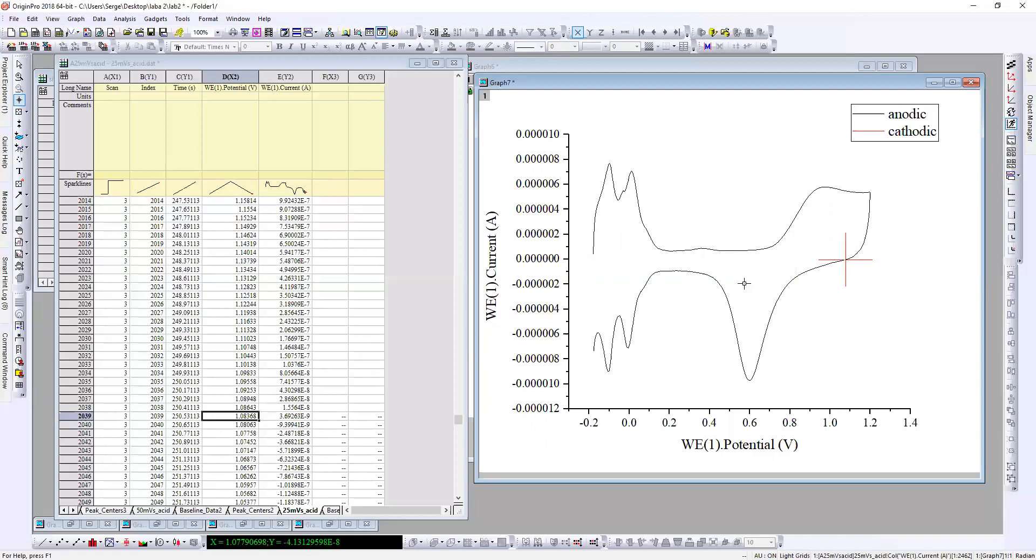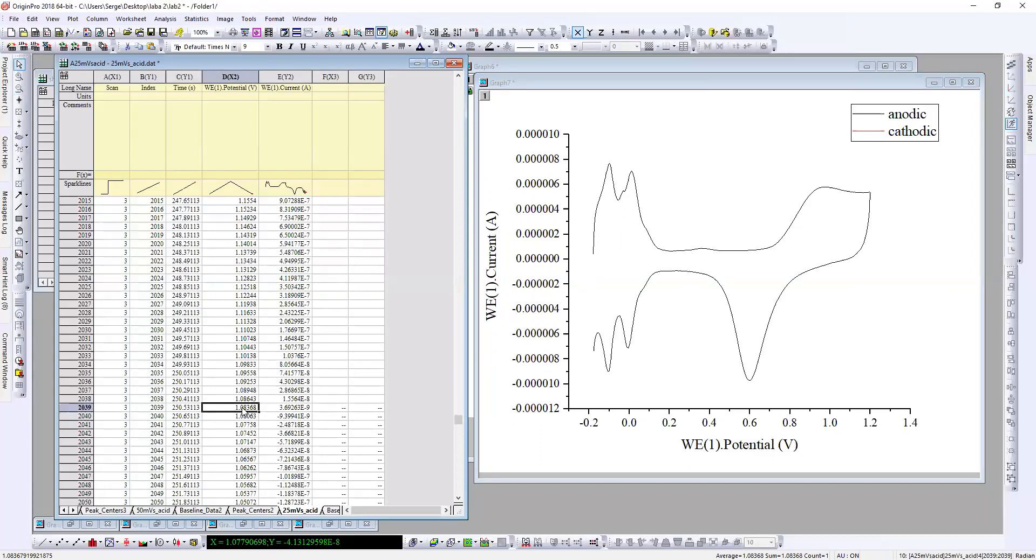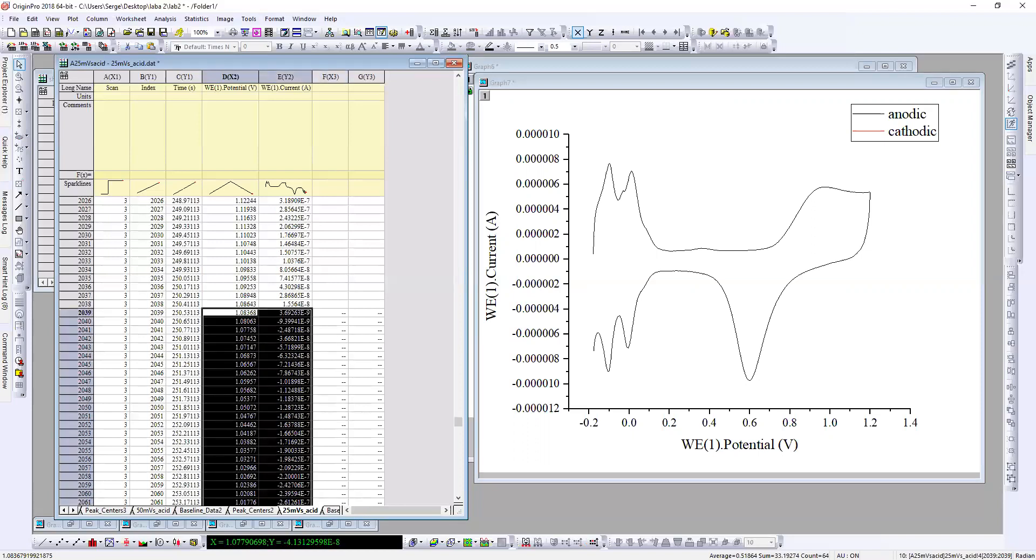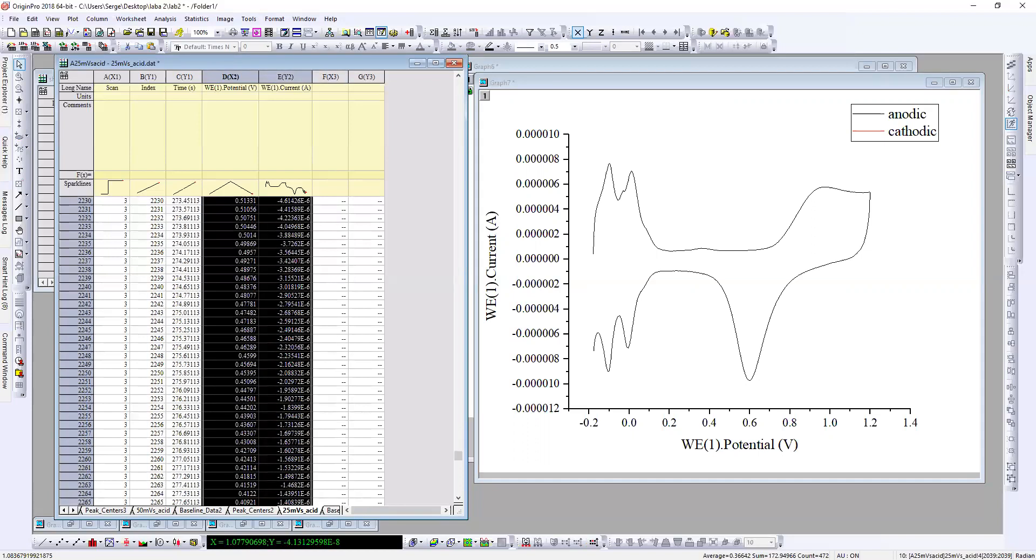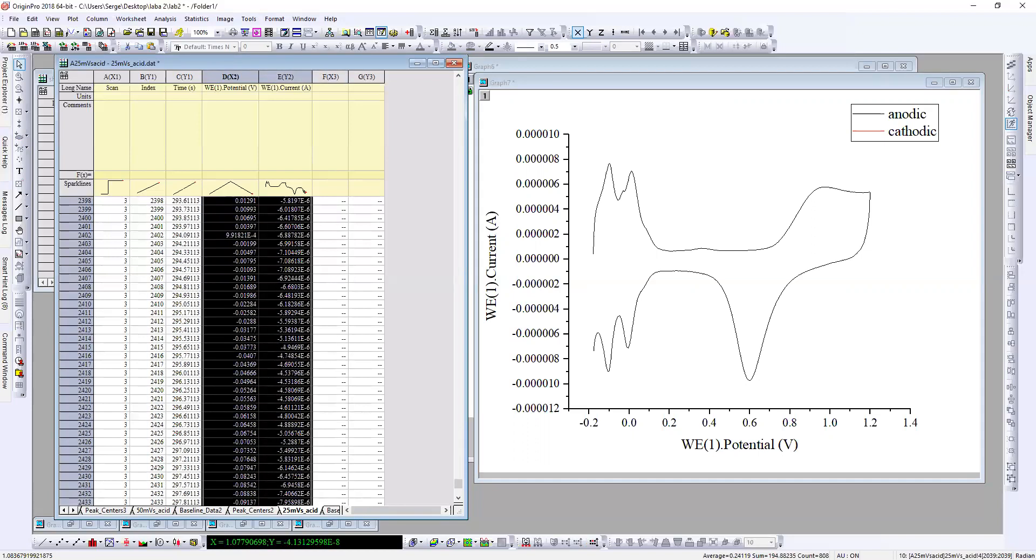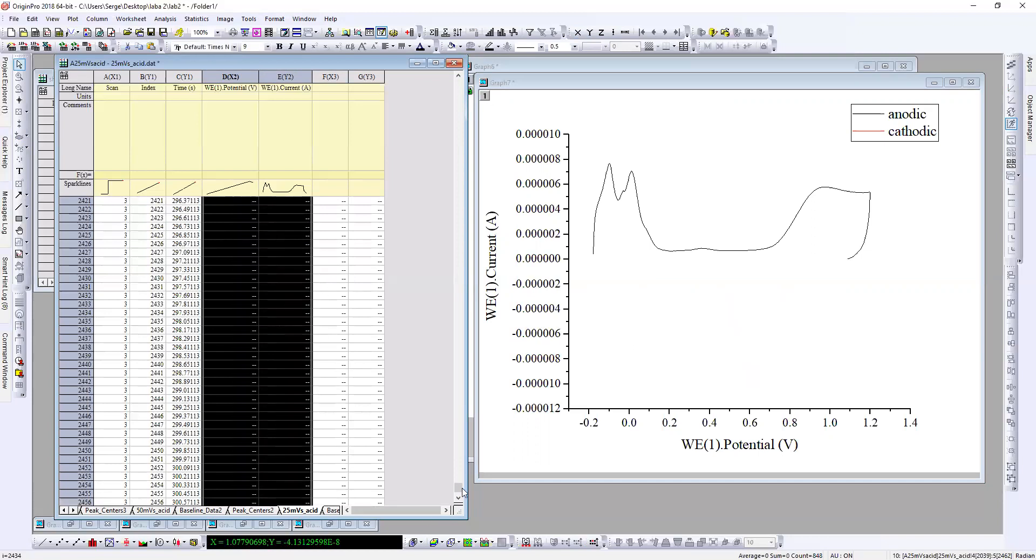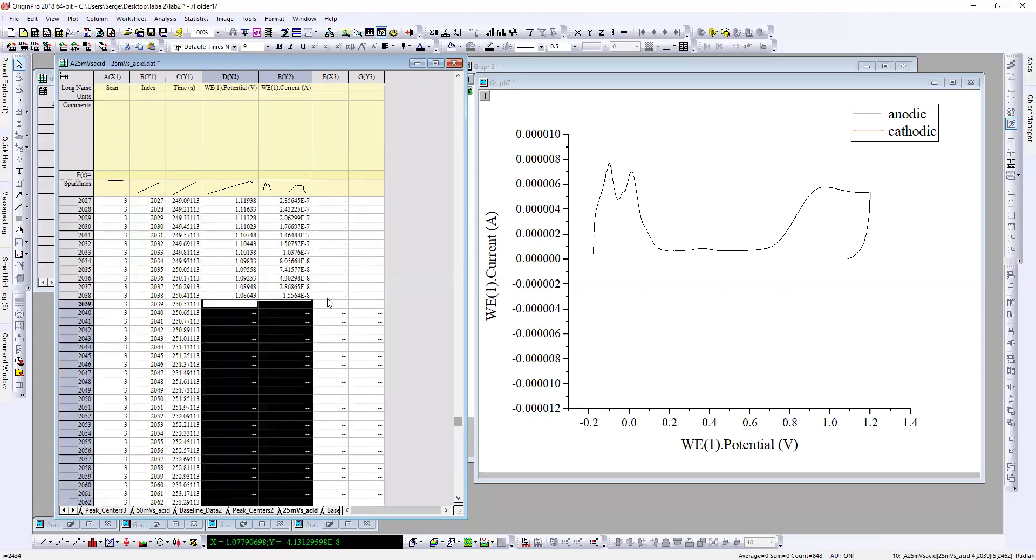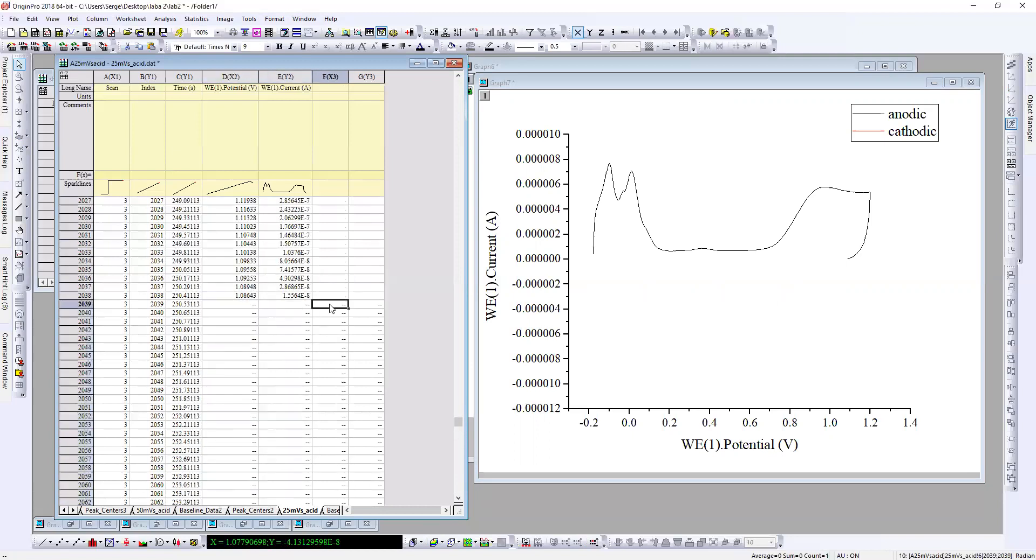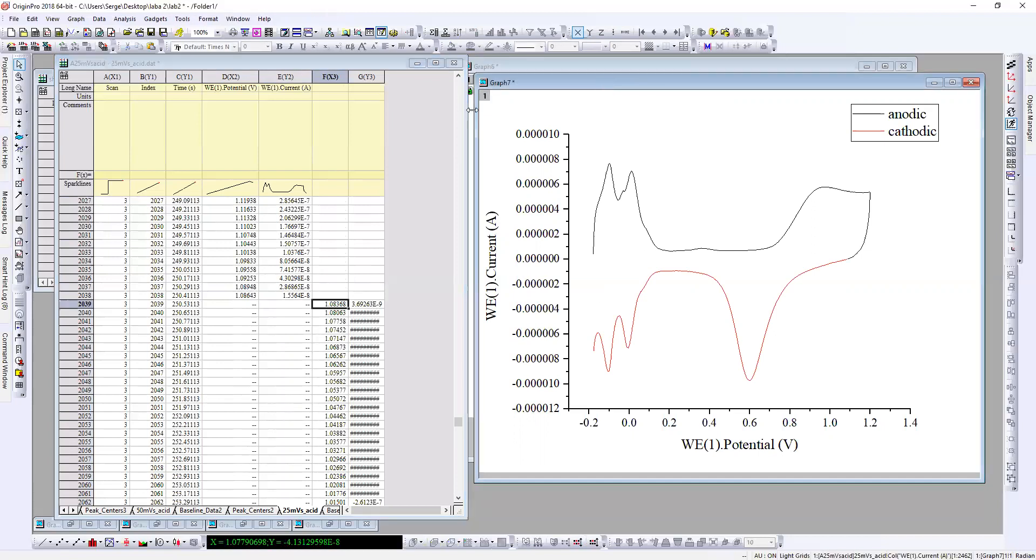I'll just find this point on the table. I already found it, so it's here. Then choose all this data set and put it in another column. So what I got is anodic current and cathodic current.